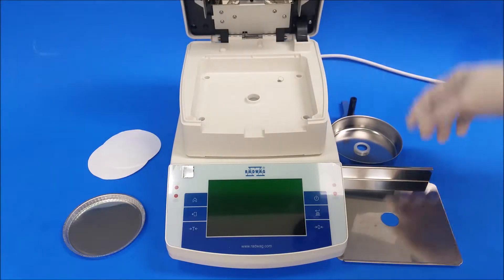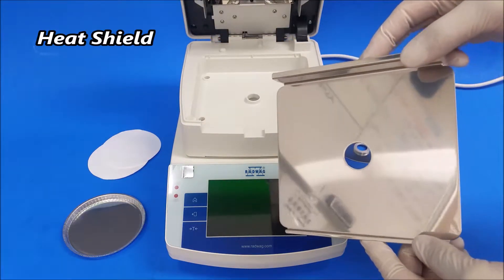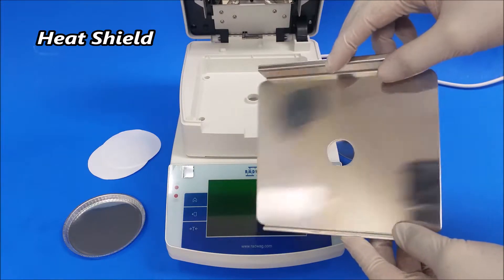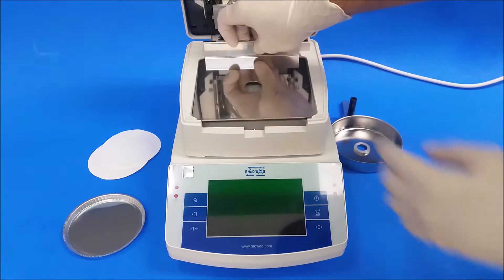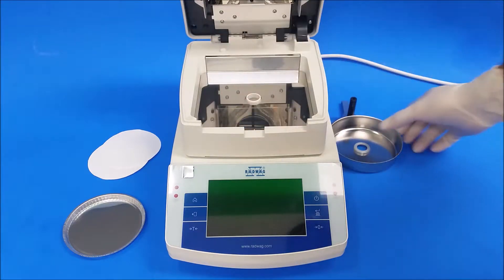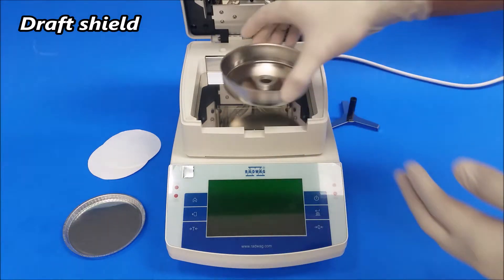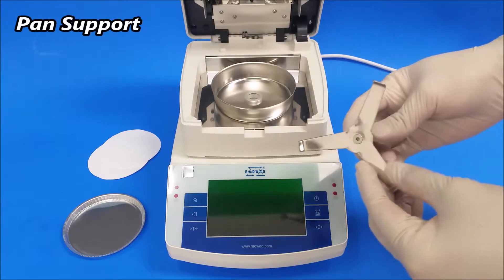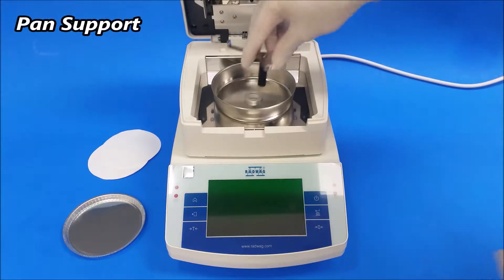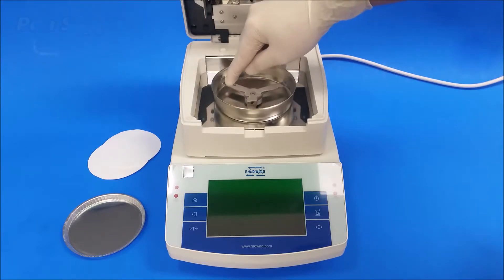The first piece going in is the heat shield — it's already in the unit but I took it out to show you. The second piece is the draft shield, and the last piece is the pan support. Just put it in there gently and slowly, then turn it into the draft shield.